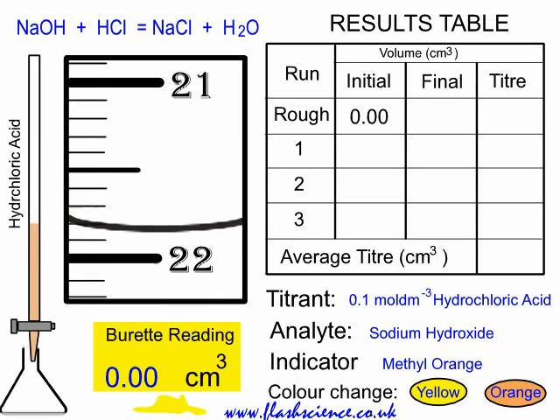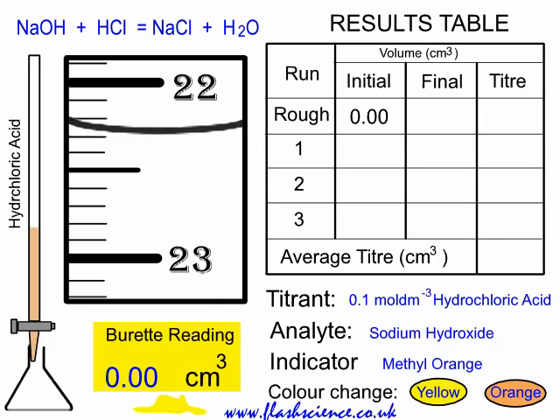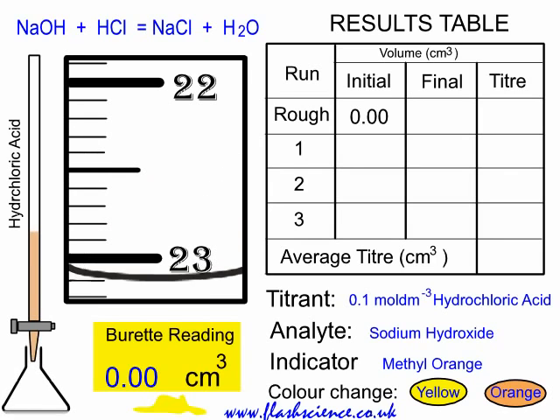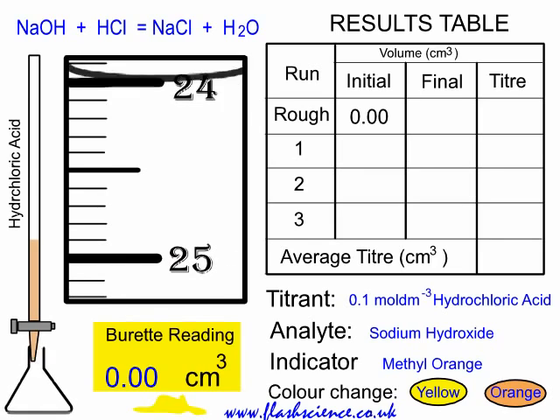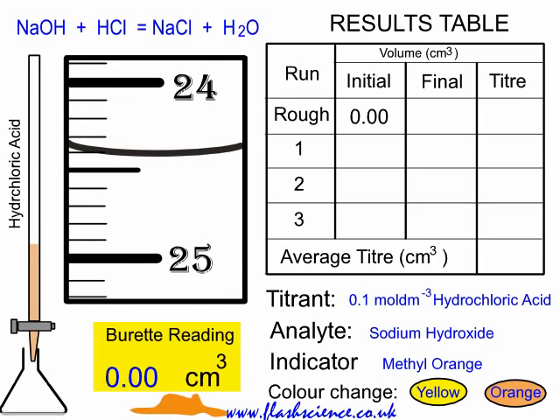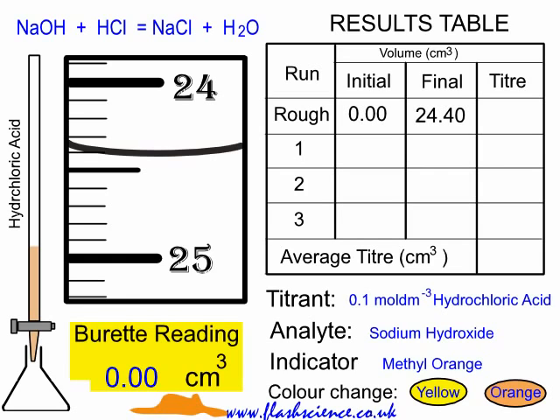As you begin to approach the endpoint, you'll notice it go from yellow to orange a little bit, but then go back to yellow. Eventually it'll go orange and stay orange, and at that point you should be ready to turn off the stopcock. We read the bottom of the meniscus — it's on 24.40. We recorded the initial and final readings, so our rough titer is 24.40.